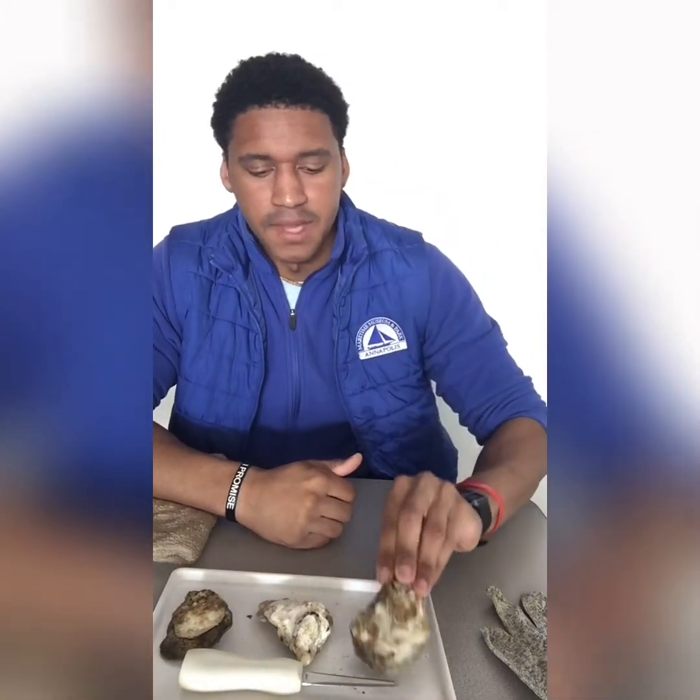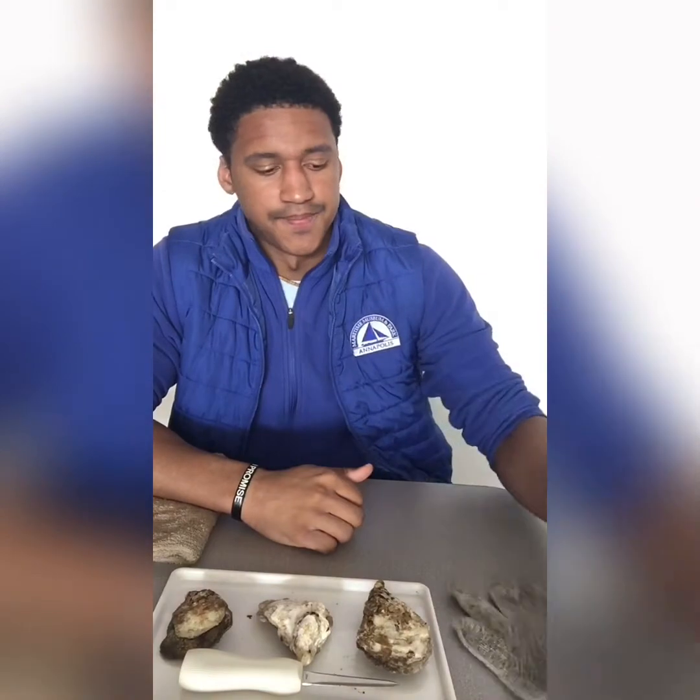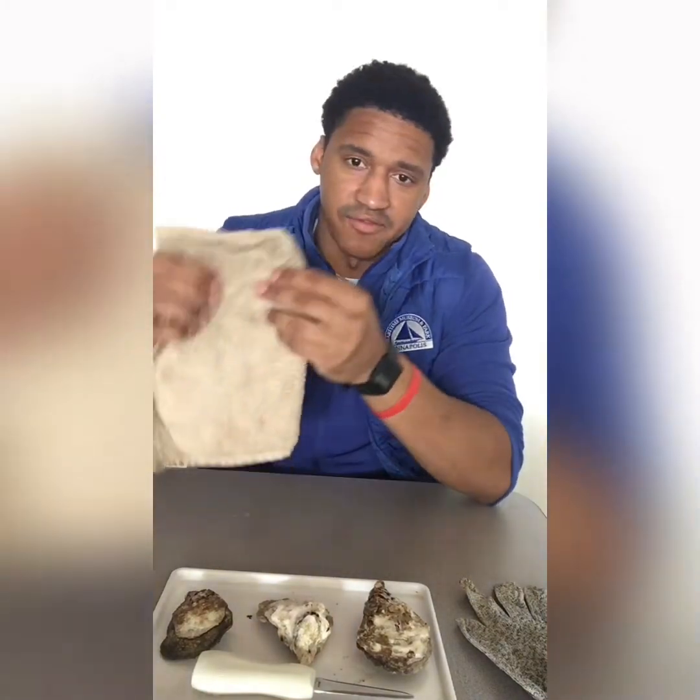Today I have a very special video for you. I will be dissecting the friendly neighborhood eastern oyster. Now remember, safety always comes first, so you'll need a few things. First, you'll need your shucking glove. You'll need your shucking knife. You'll need a rag or a towel.